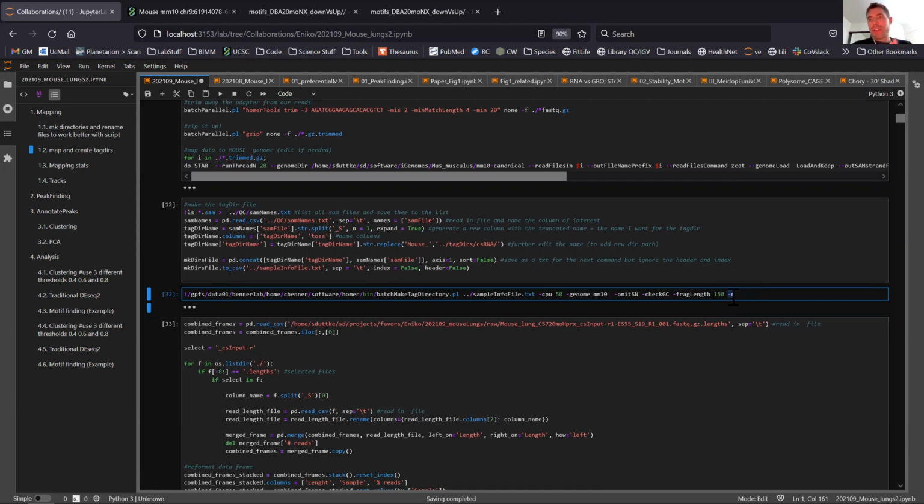So if that's too much and already confusing, that's fine. Just go ahead. For those of you who are familiar with that, there are different ways of analyzing data. For example, we can pool our samples or we can use them as individuals. My personal preference is always for calling features, let's say peaks, I like to combine my tag directories. And so that's why this -r function generates both a combined tag directory profile as well as the unique ones. Let's say you have 3 replicates, you would get replicate 1, 2, and 3, and the combo one if you have the -r function.